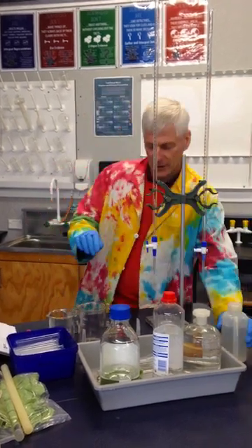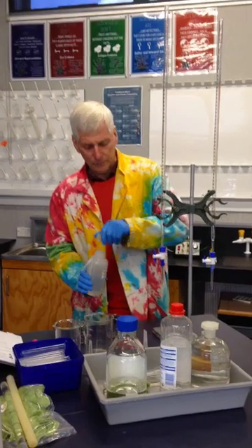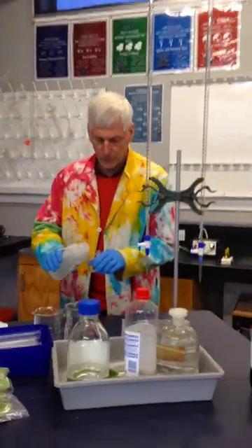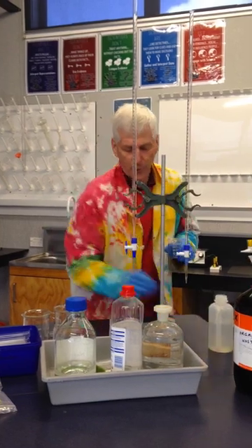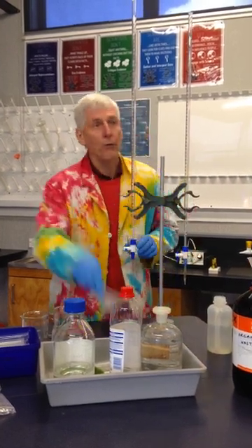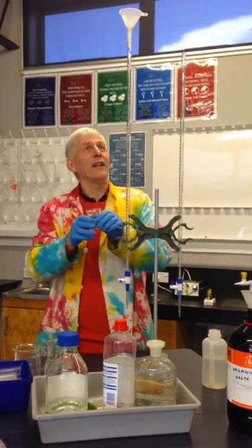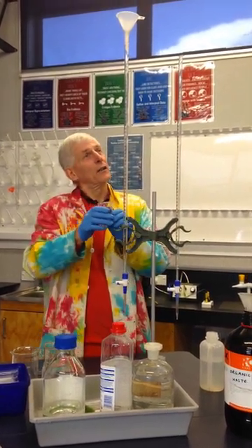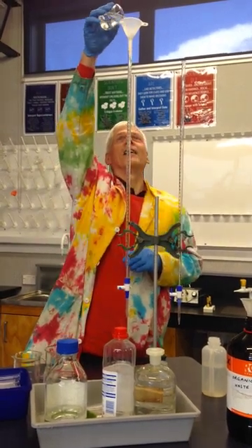So I'm just going to take some water from this water bottle, and I'm going to use a funnel just to fill this burette with water. So as you're looking at it, that will be on the left hand side and my right hand side.